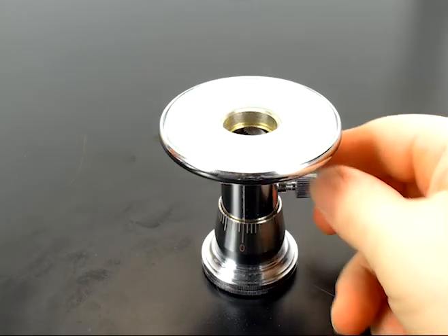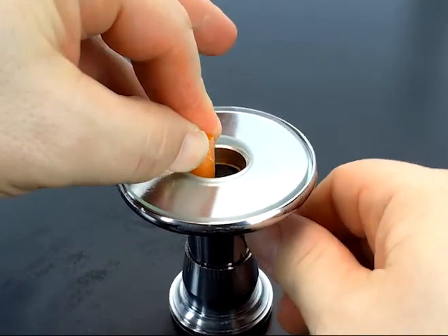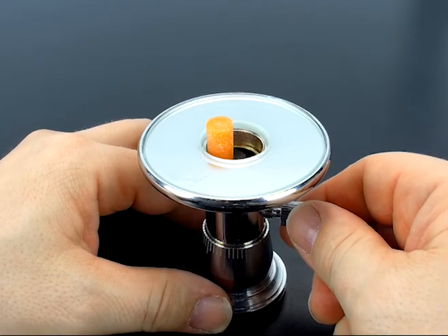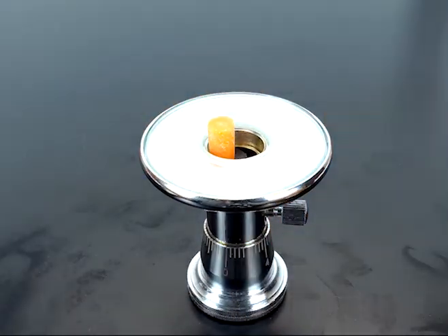The first step is to place in your sample — the little clamp on the inside will hold it stationary. If you have a soft sample like a root tip, you will have to embed it in paraffin before you do this step.